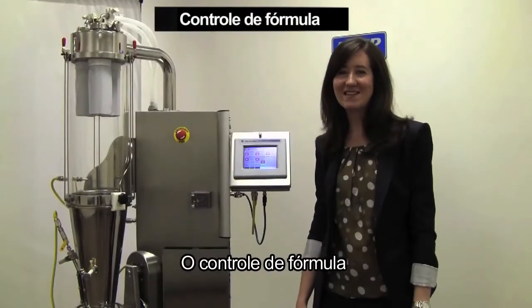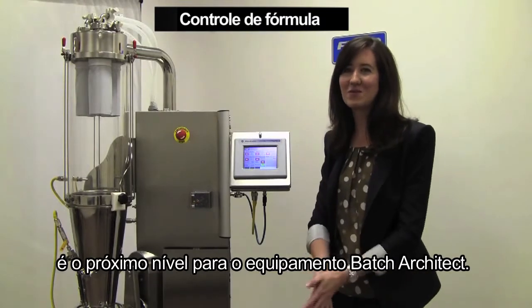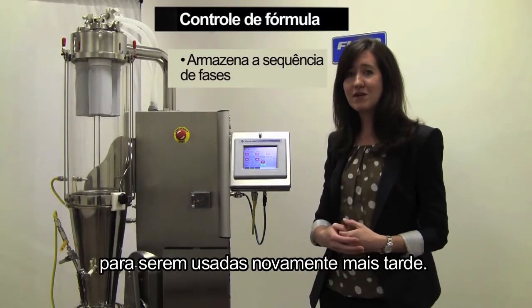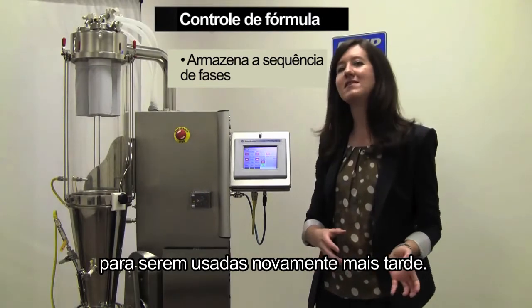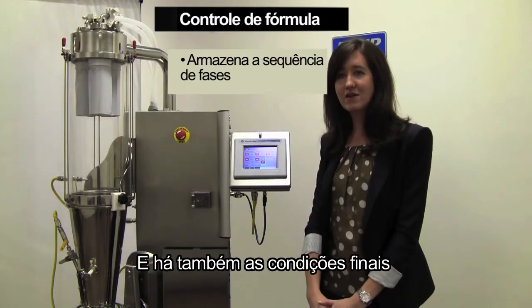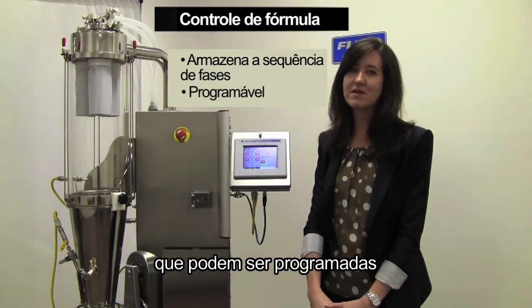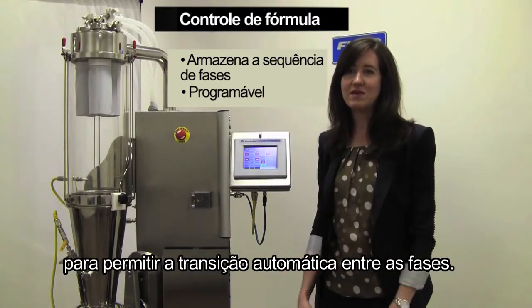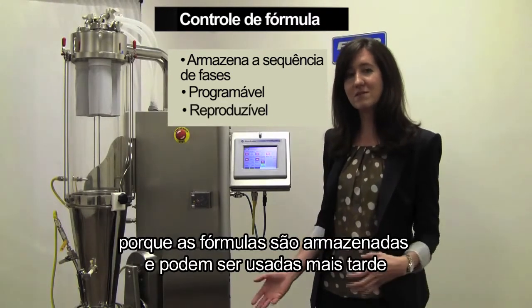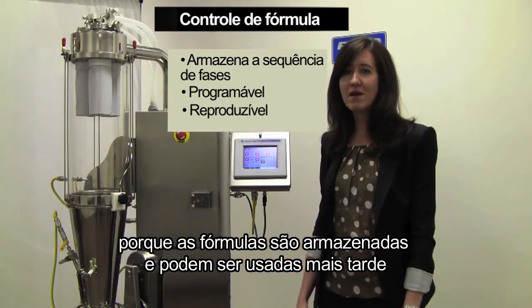Recipe control is the next level of control for the Batch Architect equipment. It actually stores the sequence of phases to be reused at a later time. These operate the same as the phase. It runs through the entire sequence, and there are also end conditions that can be programmed to allow automatic transitioning between the phases. This offers more reproducible control because the recipes are stored and can be reused later, and it requires little operator intervention.